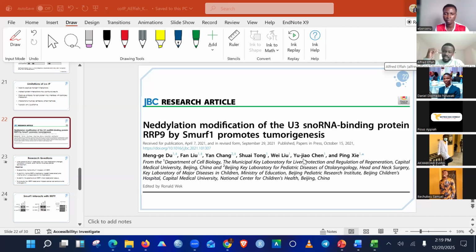You take liver, you process it, you did some sort of imaging. You know, sometimes you can culture cells, you did live cell imaging, and you are seeing all these things. Now, when you see them, that's your suspicion. So what I'm going to do is not just the interaction, but you add an extra question. So I suspect that they're interacting. That's the first suspicion. And you saw that maybe in a particular group, those with severe form of the condition, they are the ones where you are seeing the two proteins together. But when you have mild condition, the proteins are not together. And so that was what you saw at first.